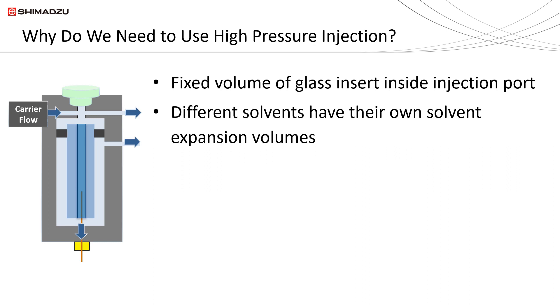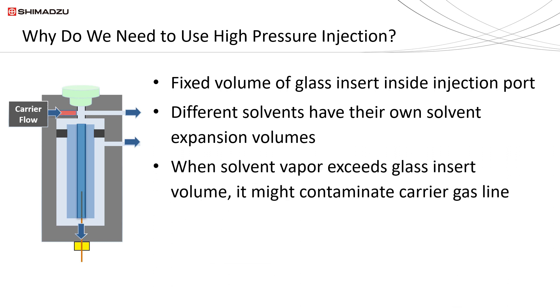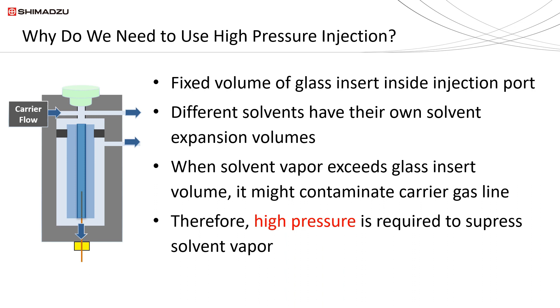When solvent vapor exceeds the volume of the glass insert, backflash will occur — solvent vapor containing the sample will overflow to the carrier gas line. The carrier gas line is not heated, so condensation will occur. When condensation occurs, it means samples will stay in the carrier gas line as contaminant. In such a case, there is a need to increase the pressure so that solvent vapor is suppressed and not overflowing to the carrier gas line.